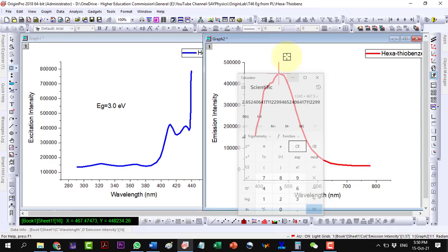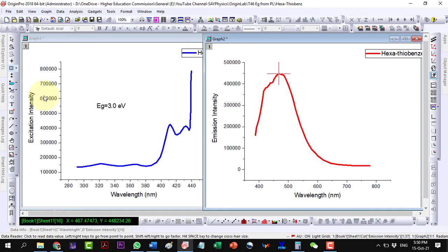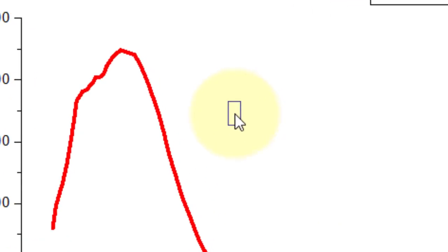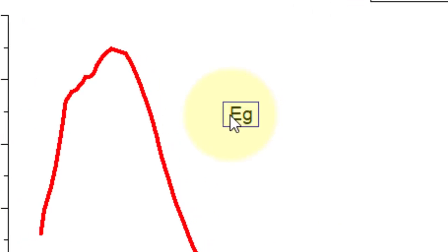Thus, the bandgap value in the emission spectrum comes out to be 2.6 electron volts.